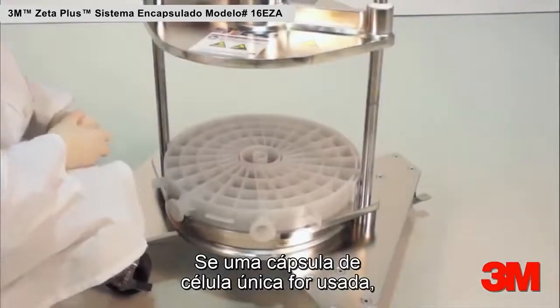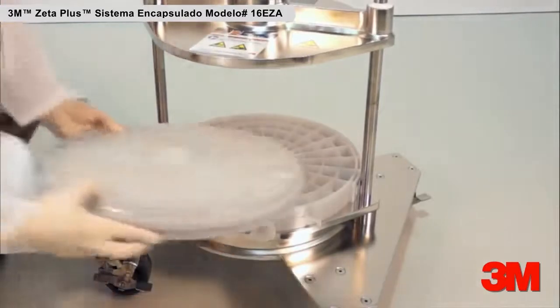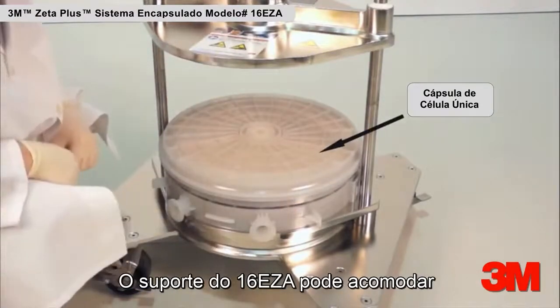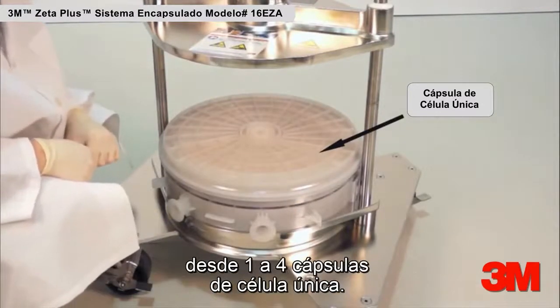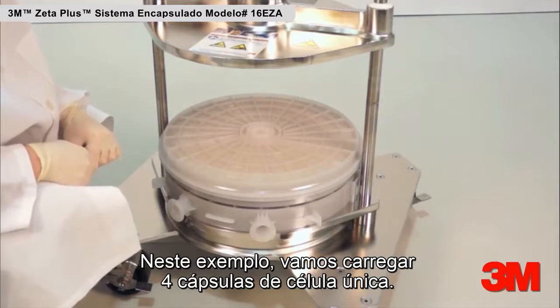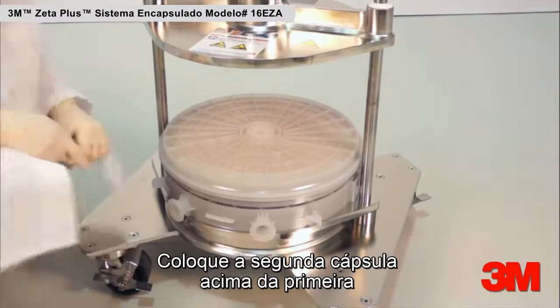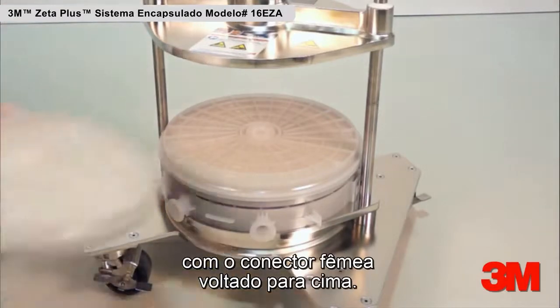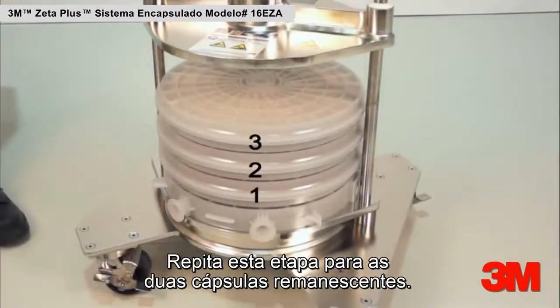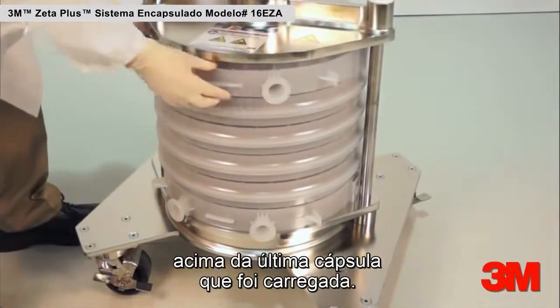If a single-cell capsule is used, place one single-cell capsule on top of the bottom manifold with the female connector facing upward. The 16 EZA holder can accommodate from one to four single-cell capsules. In this example, we will load four single-cell capsules. Place the second capsule on top of the first capsule with the female connector facing up. Repeat this step for the remaining two single-cell capsules. Place the top manifold on top of the last capsule that is loaded.